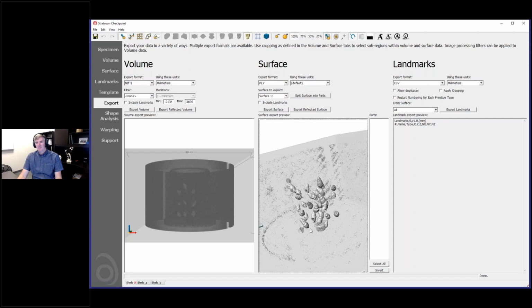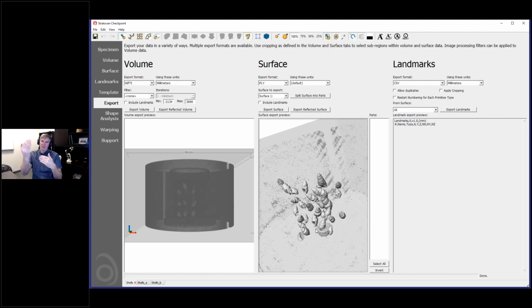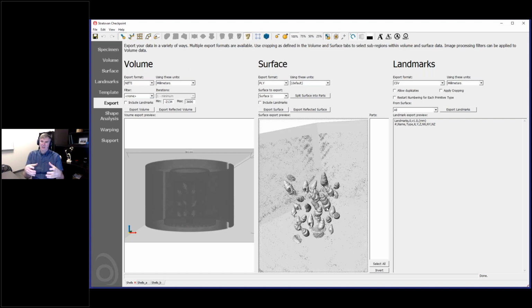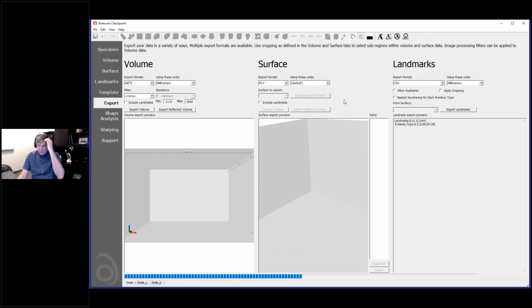If the isosurface that was extracted for this represents a single density value throughout your specimen, if the surface connects and touches all of the different parts, then you're going to get one single triangle mesh for that object. Because each of these shells were compartmentalized in the scanning process, they're not touching. And so if you click this button, we should be able to divide all of those components into individual surfaces that can be extracted. Hopefully this doesn't crash my computer. Let's see what happens here.